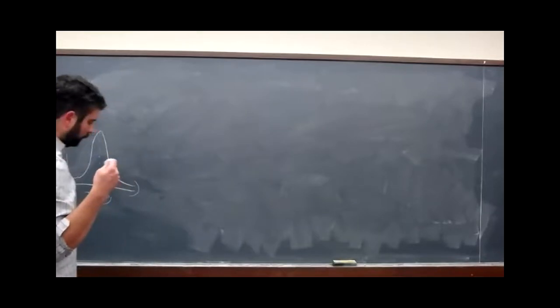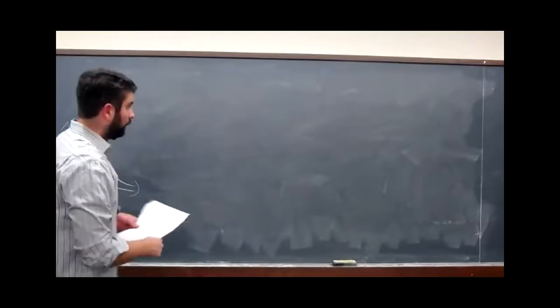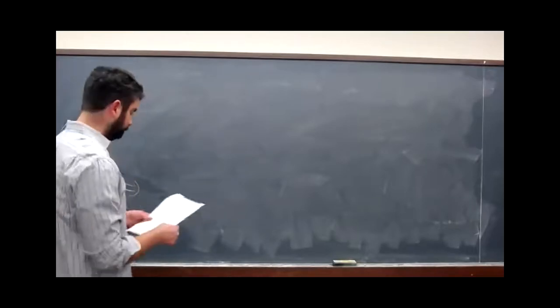So you have to be very careful when you choose a peak that you know why you're doing it. Your choice of peak function can affect the final answer that you get out, whether it's the area under the curve or the centroid or the width. You can put the exact same data into different peak functions and get different answers out.